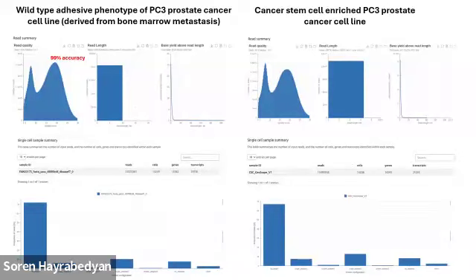What you see here is a long-read sequencing quality analysis. The median of the sequence data is more than Q20, which means 99% accuracy or more. The average length of detected reads was like 900 to 1.2K nucleotides with an N50 of 5 kilobases.